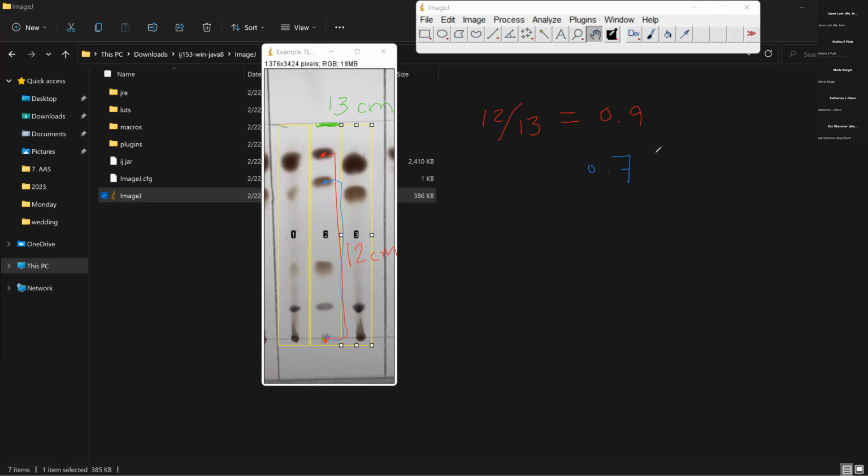As long as I'm using the same solvent system, the same thing that's traveling up the plate, I can compare this cholesterol ester RF value to an RF value for cholesterol ester that is known under the same solvent system, and then with some amount of certainty be able to say, oh, I think that this is cholesterol ester. For this lab, we identify those spots for you, but in the real world, if you're working in a laboratory, that's a way that RF could be used.